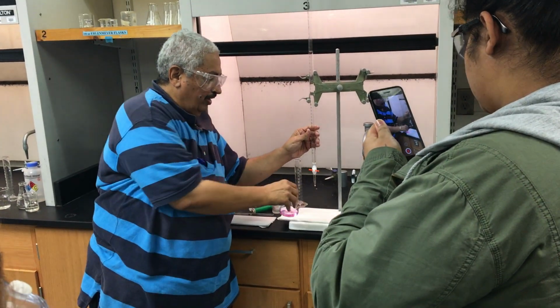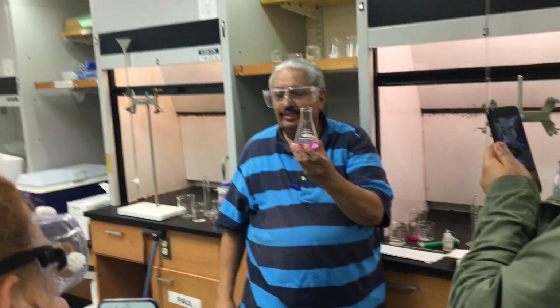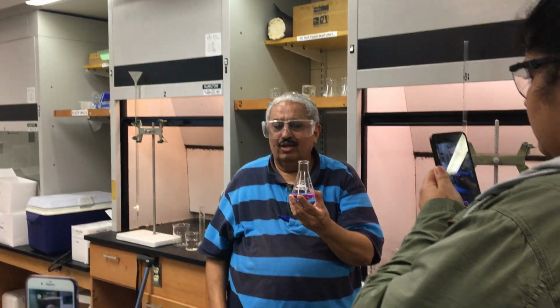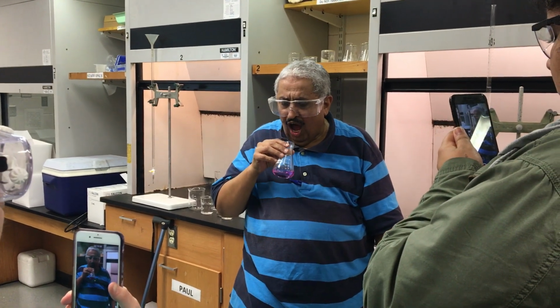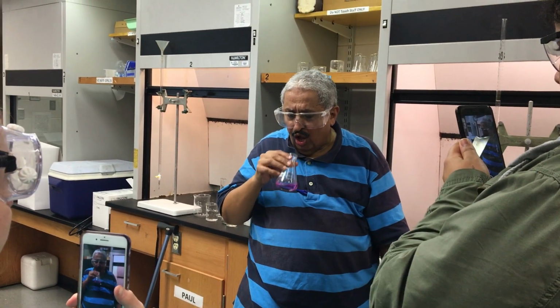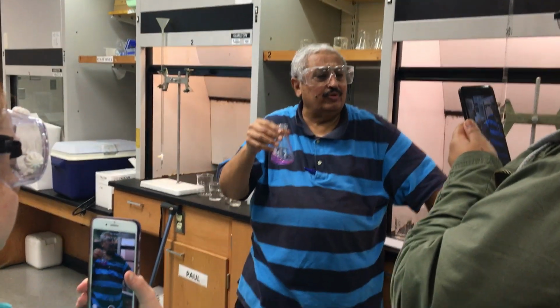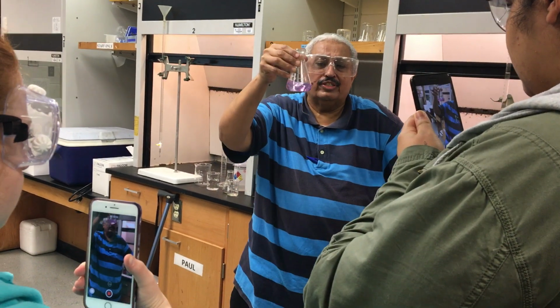Now, if I keep it here for a couple hours, the pink color will turn colorless. Or if I have exhaled, the color will disappear. What happened? If I keep it for a while, the pink color will disappear, correct?